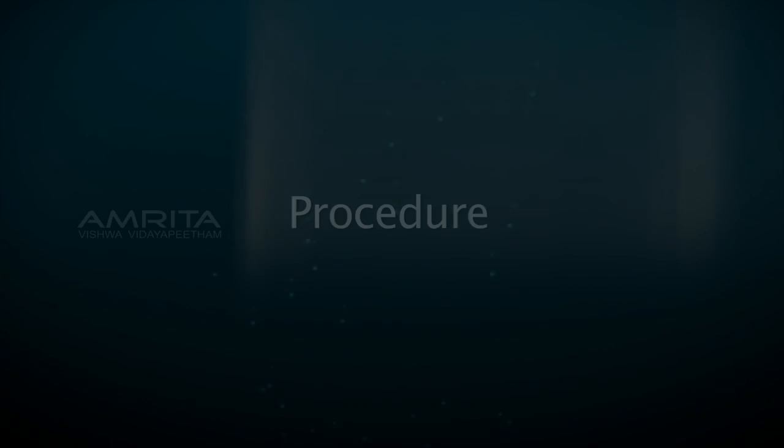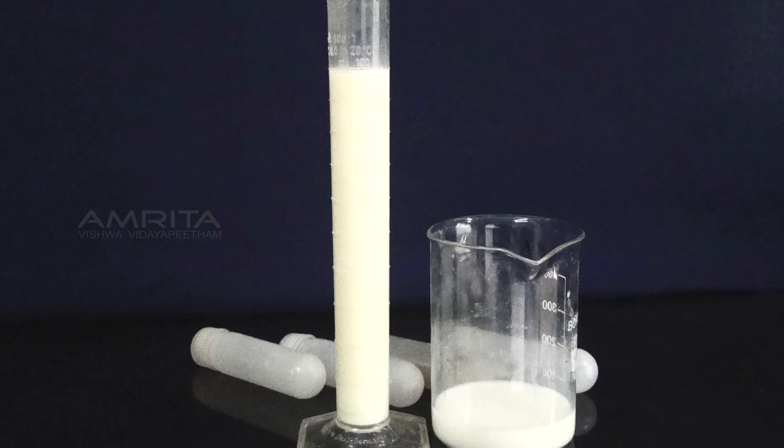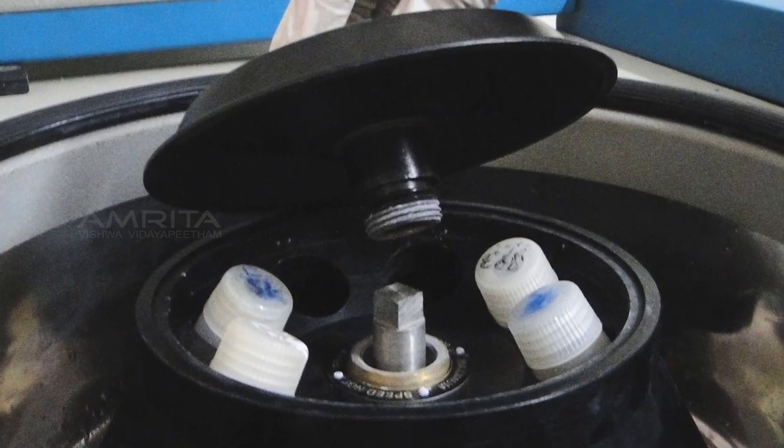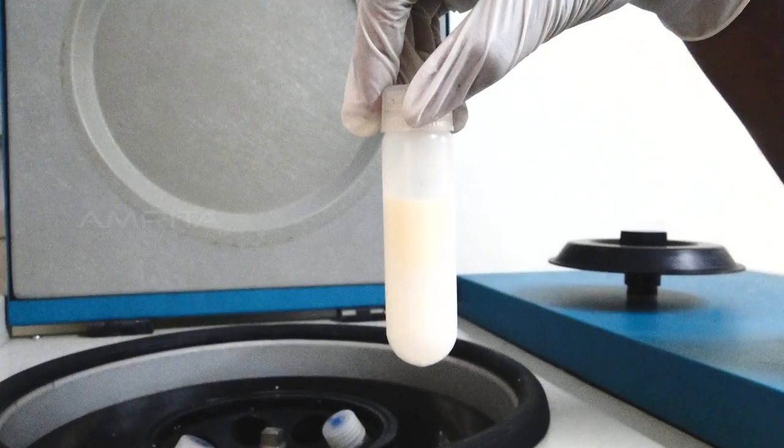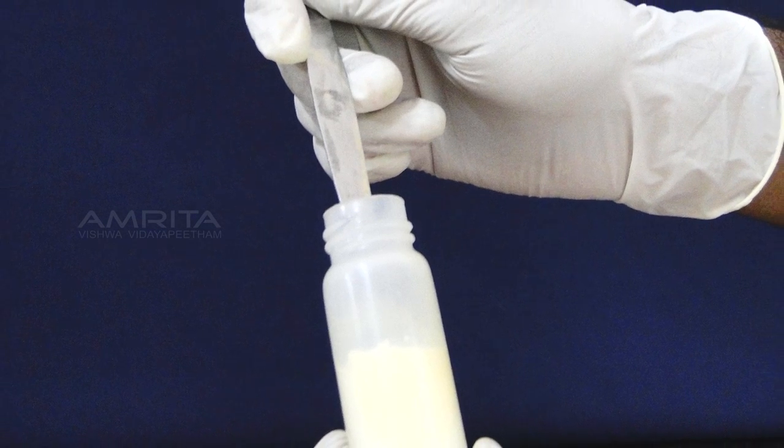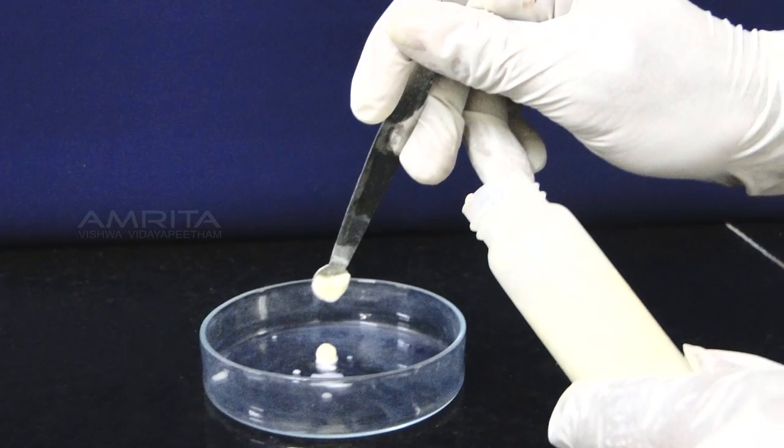Procedure: 100 ml of milk is centrifuged at 4000 rpm for 20-25 minutes at room temperature. To get the skimmed milk required for the procedure, remove the cream or fat that settles on the surface of the milk carefully with the help of a spatula.